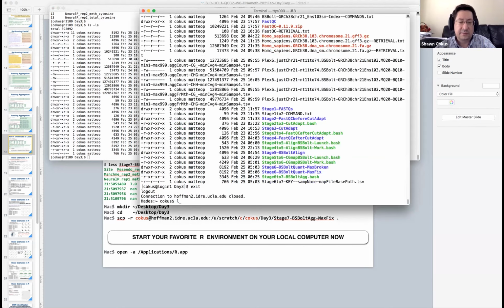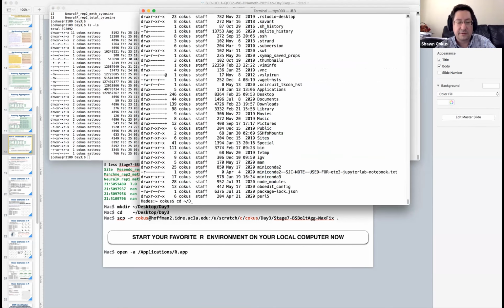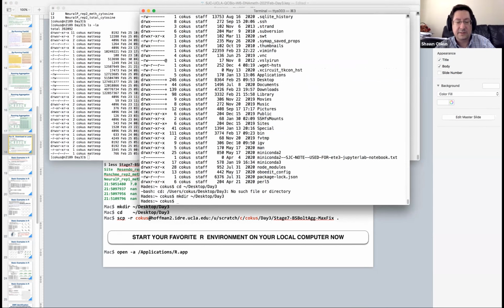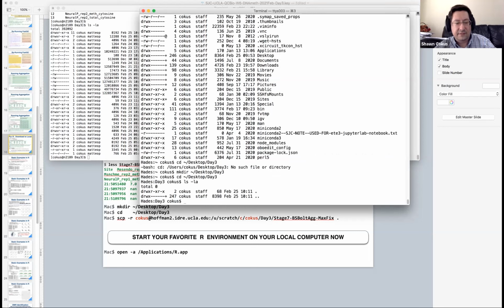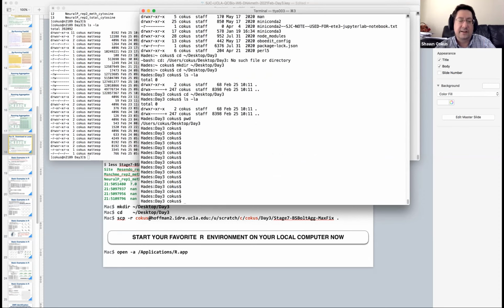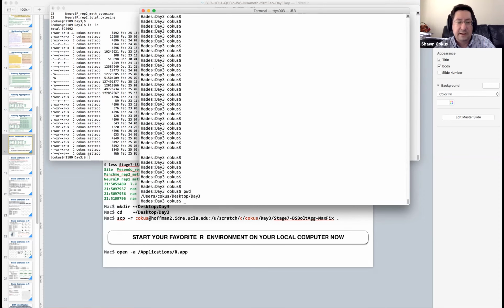So I've got this extra window here, and I'm going to go to my desktop day 3, which is a directory I don't think I made yet. So okay, desktop day 3, make dir, change to. All right, so here we are. Clear that off. This is my local machine, Hades. This is my desktop day 3 subdirectory. This is where I want to put the stuff from today that I want to copy out.